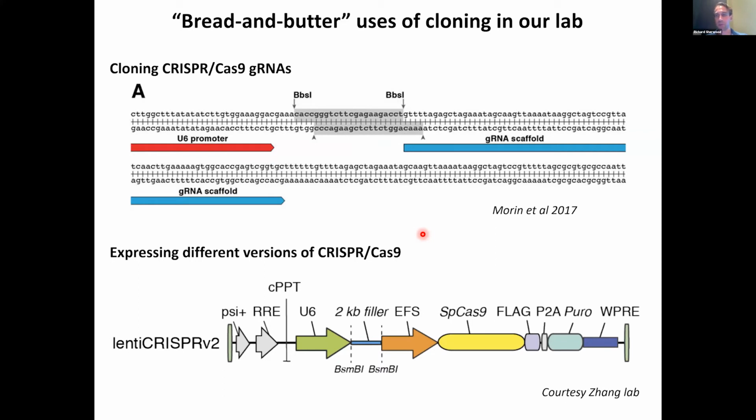the state of the art now is using CRISPR-Cas9. The CRISPR-Cas9 system, which I guess you'll hear more about next week, has two components. One is a Cas9 enzyme, and the other is a guide RNA, which is a small RNA species that has a fixed hairpin sequence that will bind to the Cas9 protein.